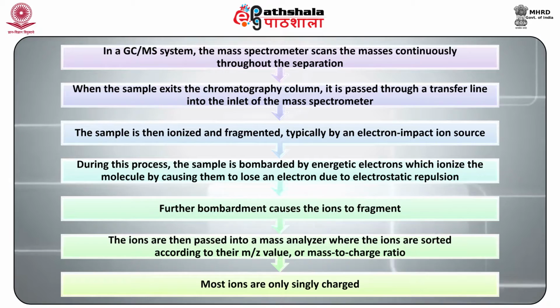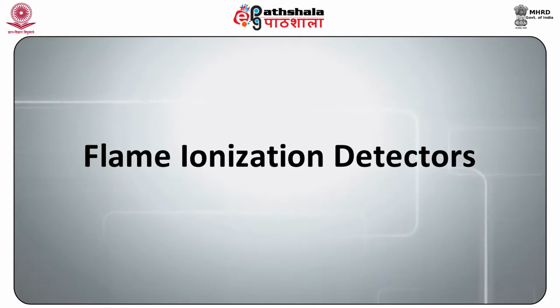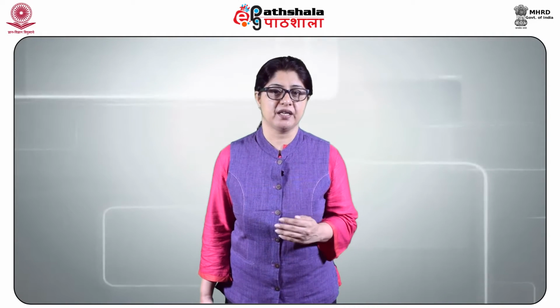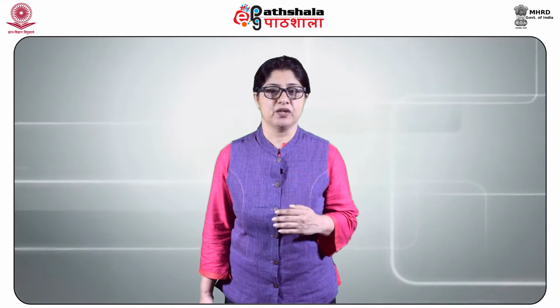The ions are then passed into the mass analyzer where the ions are sorted according to the m/z value or mass to charge ratio. Most ions are only singly charged. Flame ionization detectors. Flame ionization detectors (FID) are most extensively used detectors.